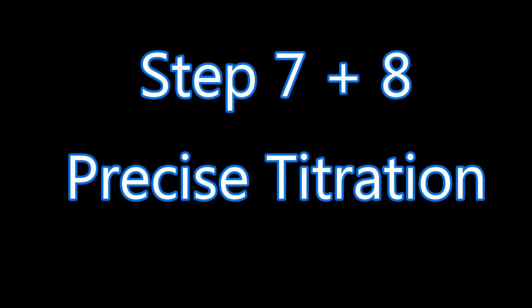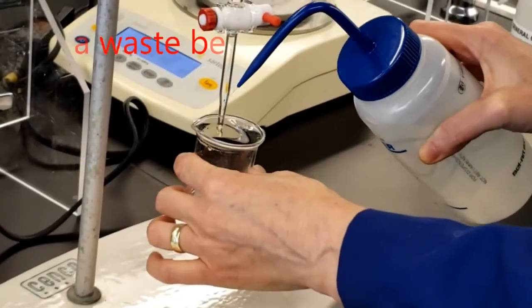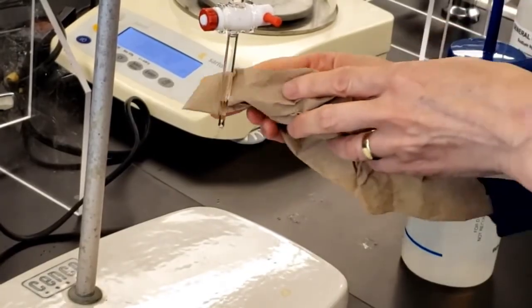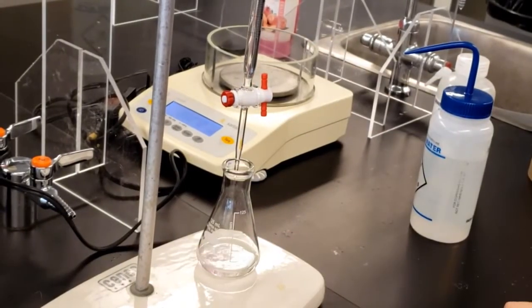Rinse the end of the burette with deionized water to wash off any solution that may have contaminated the burette in the first titration. Wipe the tip dry with paper towel. Refill your burette and prepare your sample as before. Start your titration the same way as in step 6, however take care when closing in on the end point of the titration.